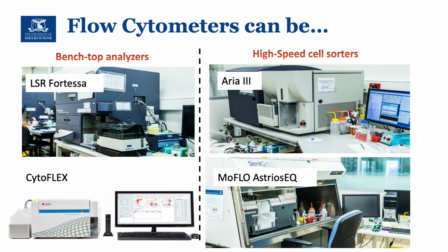Now, cytometers can be benchtop analyzers, or they can be high-speed cell sorters. I'm giving you examples here of instruments that are currently in the platform, and you can see they look quite different, and some of them tend to resemble a black box, white box in this case, but essentially they are enclosed and kind of inaccessible.